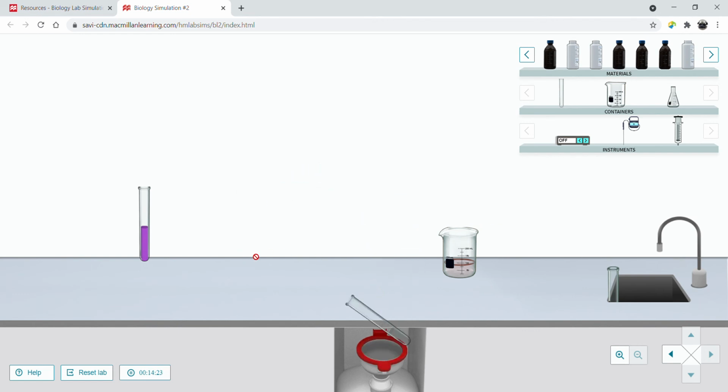Now what you want to do is remember these results, because now we have 2 different food items. We have milk and we have potato juice. Yum, right? And we are going to test both of these for those 4 substances. Now I'm on page 6.